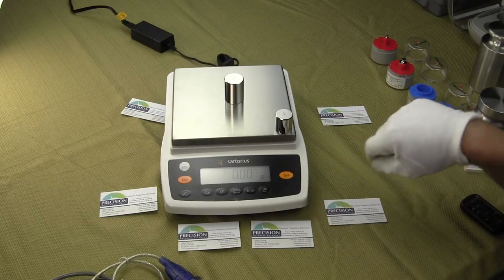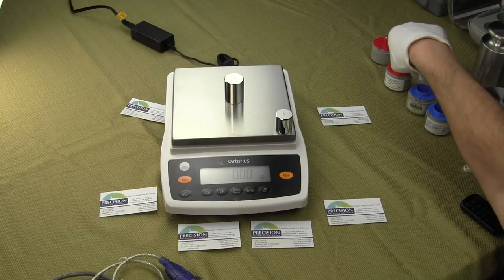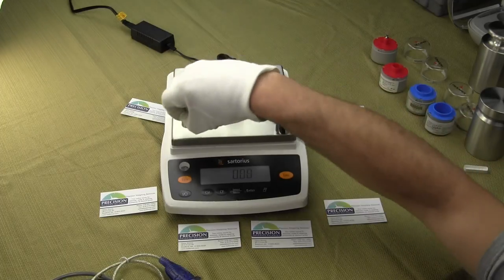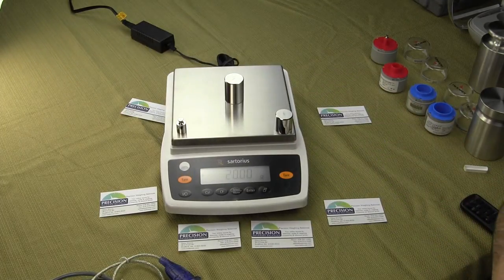We have tare buttons both right and left for your convenience. If I simply press the tare, it zeroes everything out on the platform. You'll see how fast the balance is and very stable.